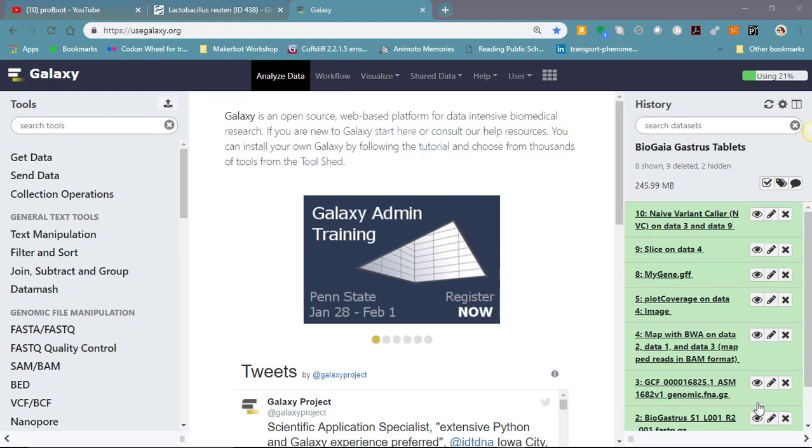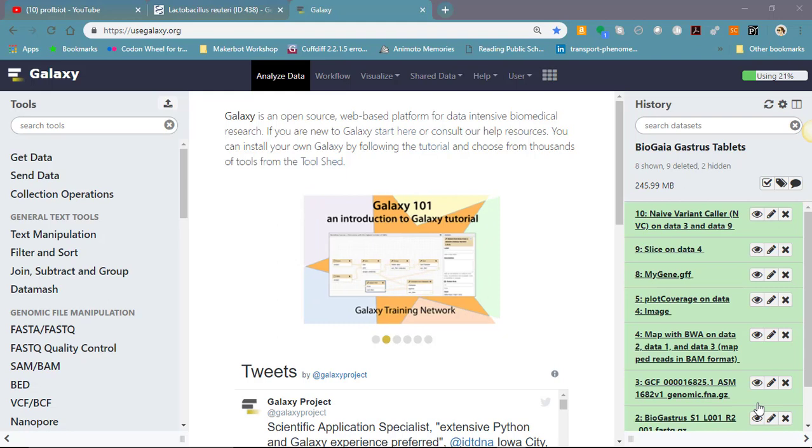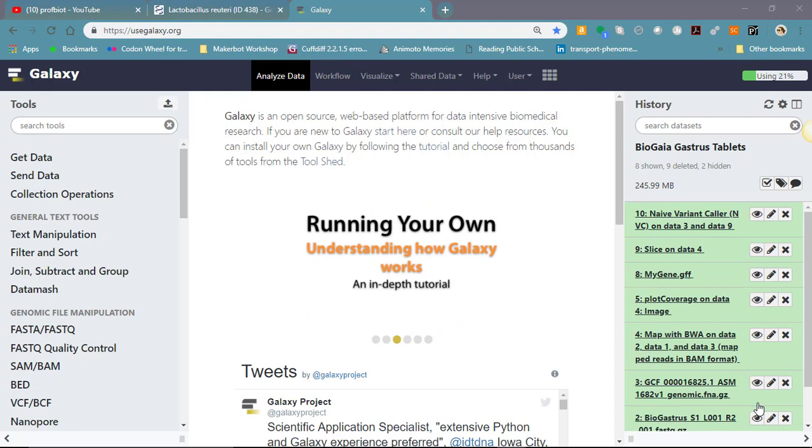Hello. In this video, you'll see how to make an IGV figure for your Unit 1 bioinformatics project. We'll look at how to download the files needed to view a genome and real sequencing data in IGV, and then we will look at how to turn that data into a figure for a single gene where individual variants are viewable by zooming in to the region of interest.